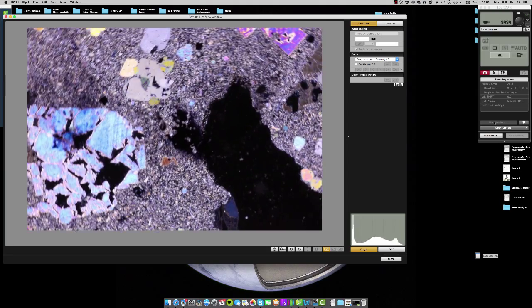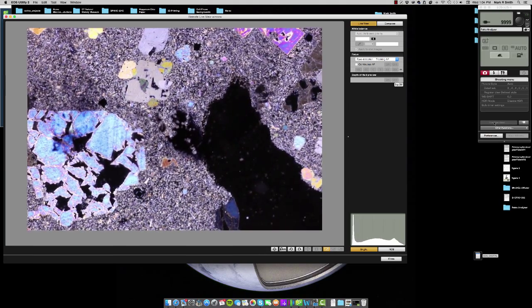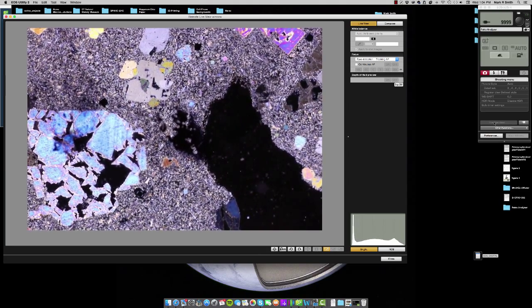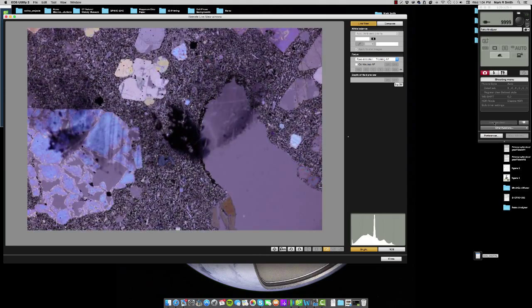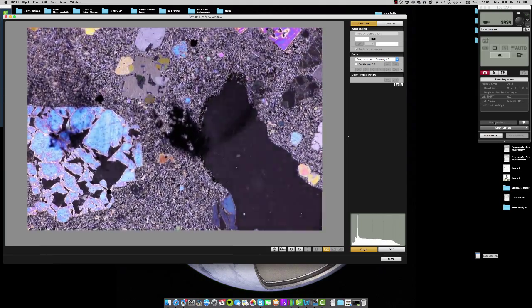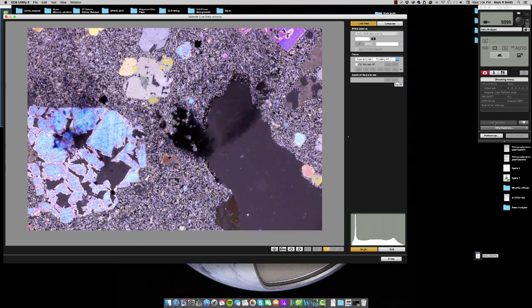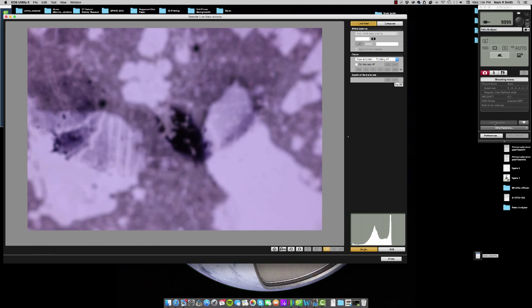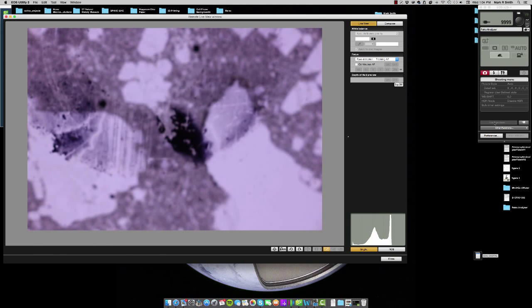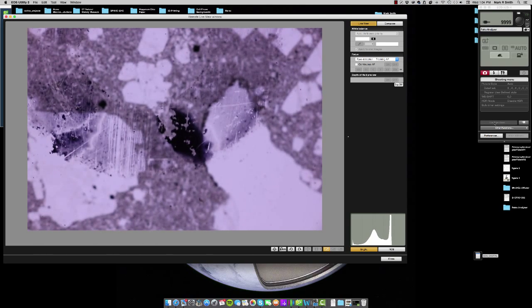So what you're looking at on screen now is something that's at 5x magnification. It's in polarized light and plain light, and you can see that we can still rotate the stage and remove and insert the analyzer.